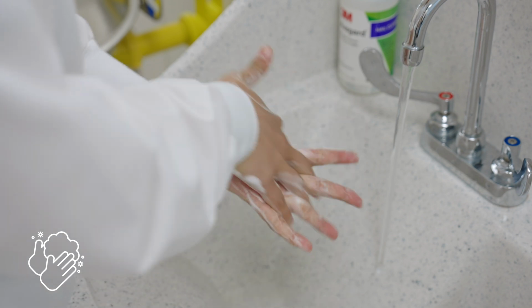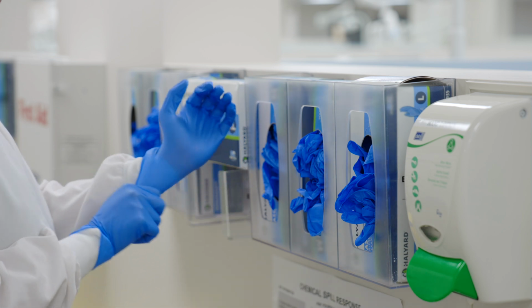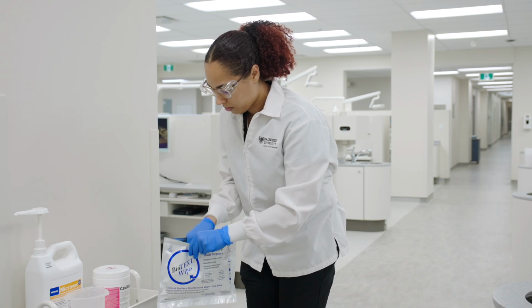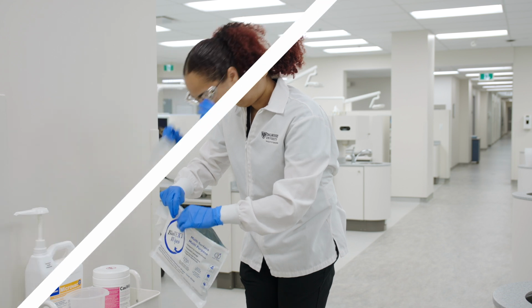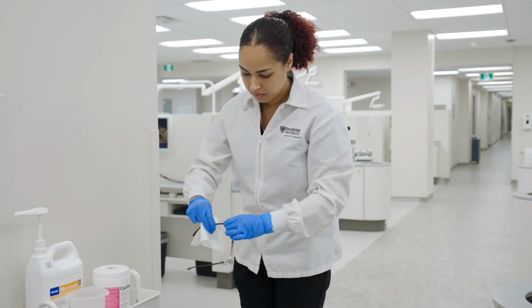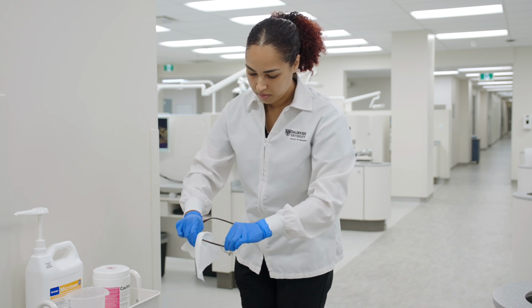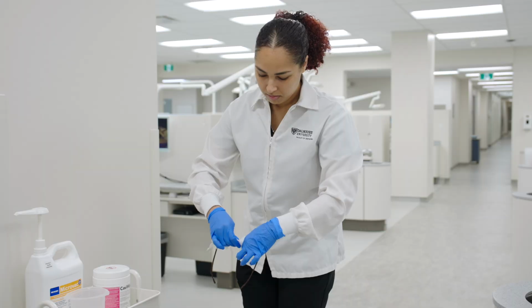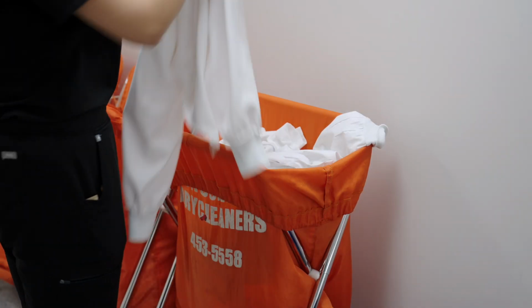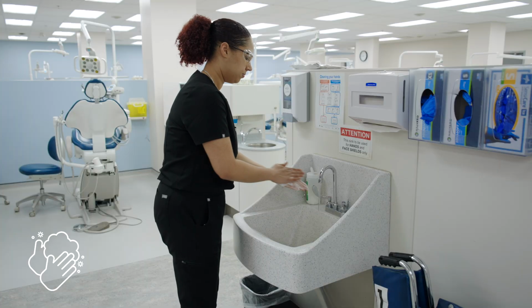Be sure to follow the proper hand washing steps. Don clean gloves and dispense an approved disinfectant wipe for glass and plastic. Remove protective eyewear and face shield if worn, and clean and disinfect items with wipe. Store eyewear and face shield as appropriate. Remove lab coat and place into the soiled linen bag or discard disposable gown. Perform hand hygiene.